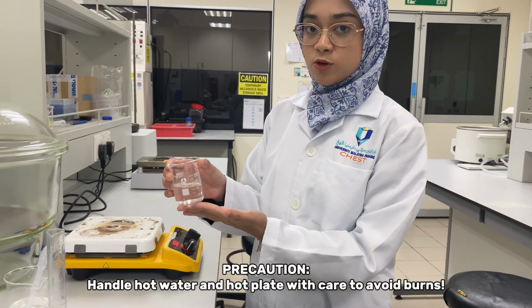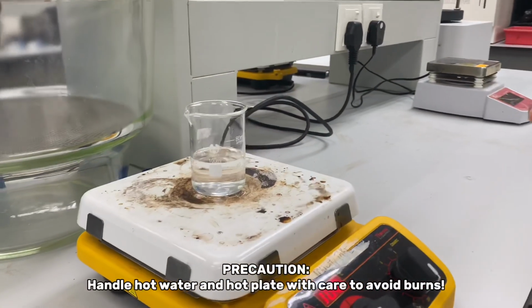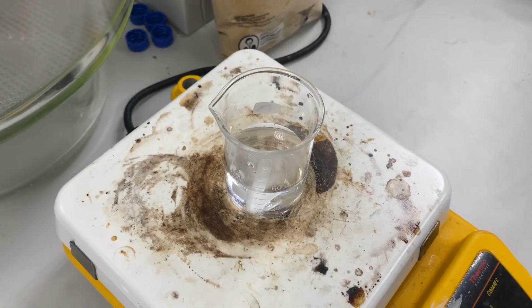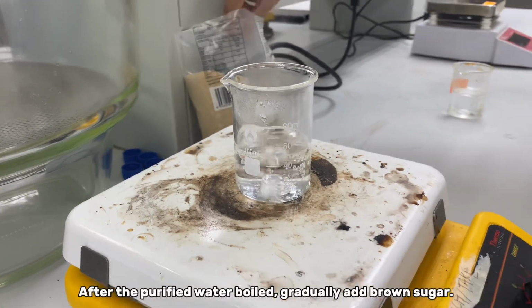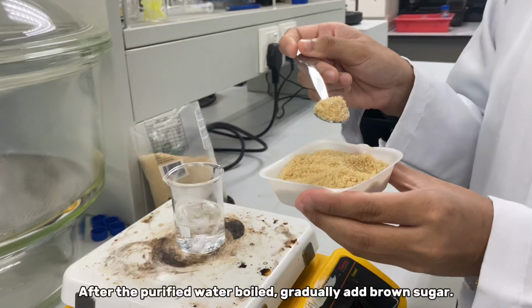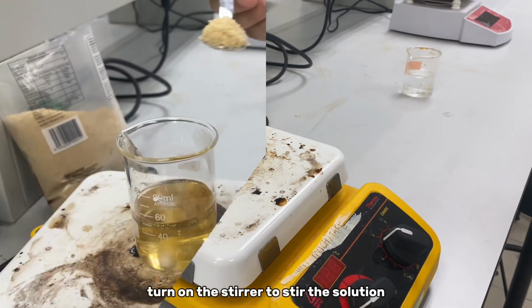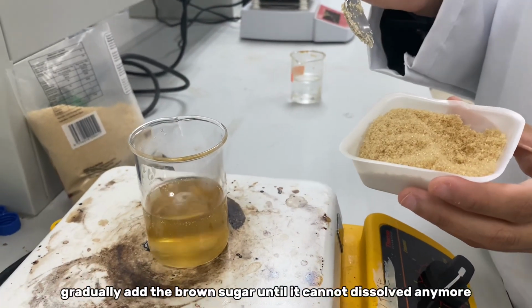Then, the measured volume of purified water is heated on the hot plate until it boils at 100 degrees Celsius. After the purified water has boiled, I will gradually add brown sugar into the hot water. I will continue adding the brown sugar until it cannot be dissolved anymore in the water.